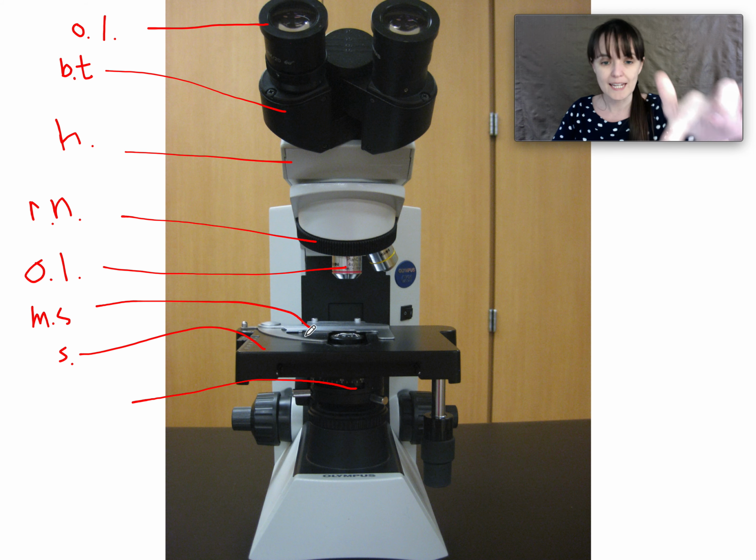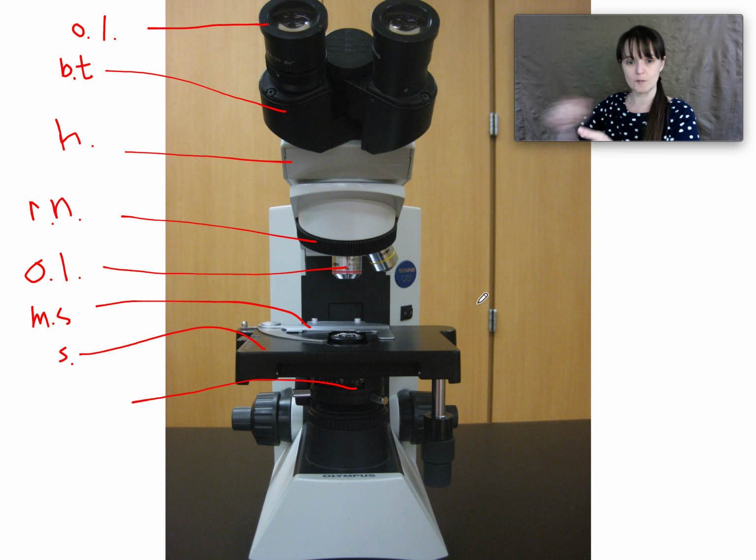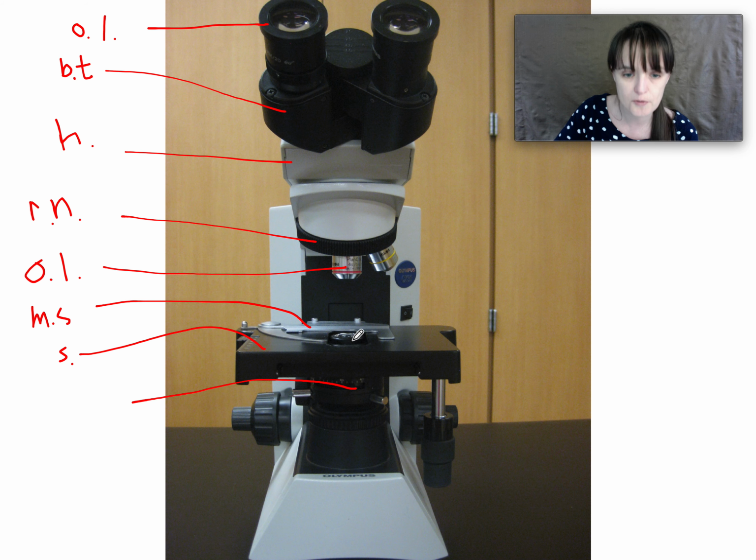Inside, there's an iris. It's a bunch of plates of metal, and then when you move that slide, they close down to make a smaller aperture for the light to come through, a smaller opening for the light to come through, and then you'll have a little bitty round circle of light. So when you go to look in the scope and you only have a tiny little circle of light, that's the problem.